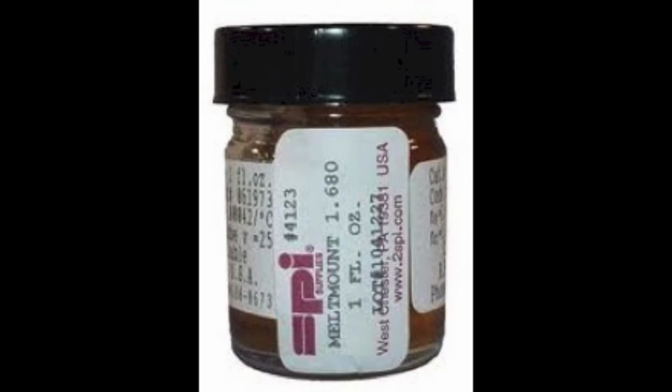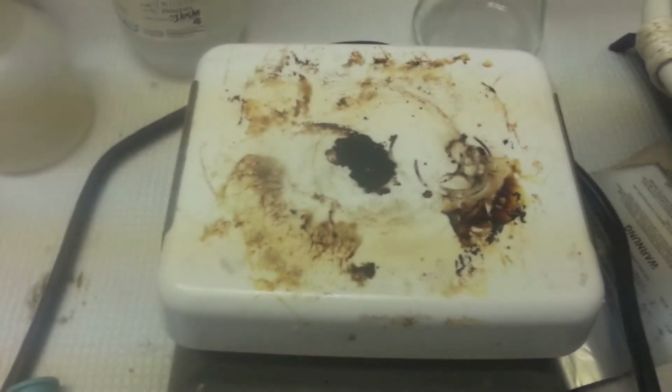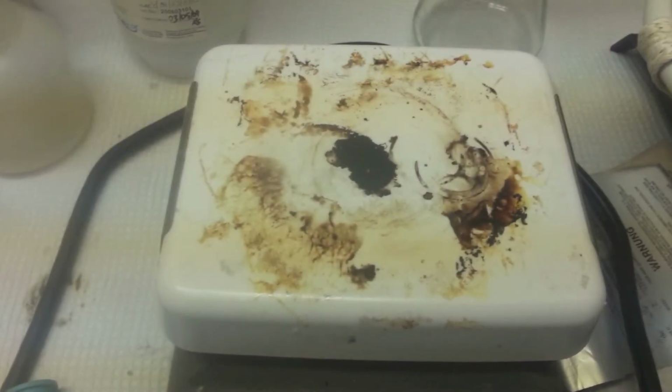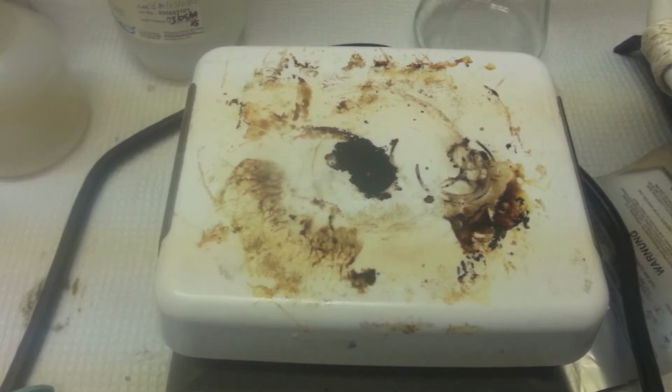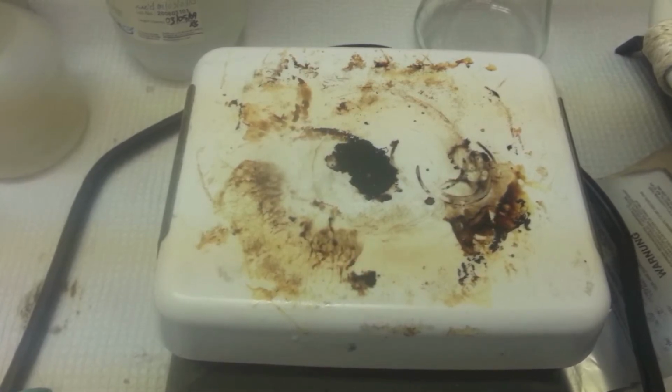Conversely, the melt mount is generally used as a semi-permanent media, although it can be a permanent one as well. When it is applied at room temperature, it is a solid. However, when exposed to heat, it forms a liquid. Therefore, the slide must be prepared with a heat source so that the melt mount is in a liquid form. Once the heat source is taken away, the melt mount solidifies on the slide with the sample embedded in it, thereby making it permanent. However, if heat is applied again, the melt mount will liquefy and allow for manipulation of the sample, thus making the semi-permanent melt mount.